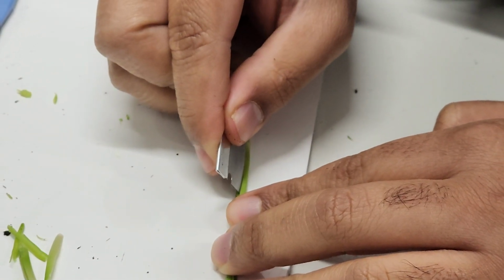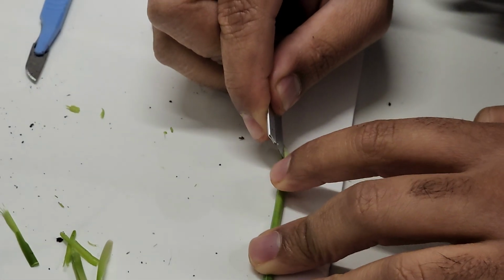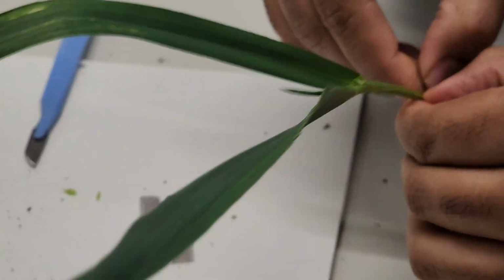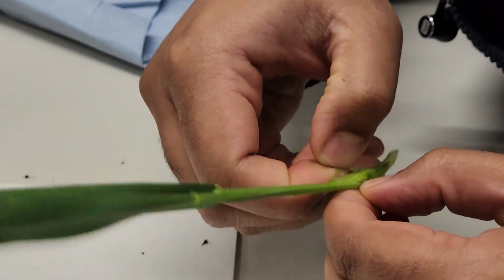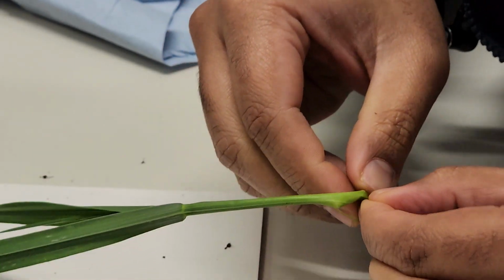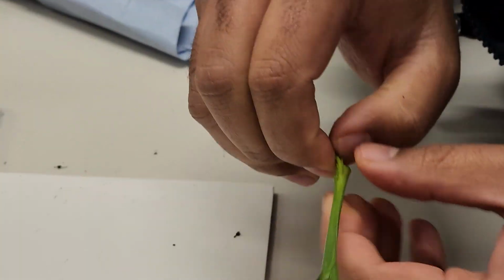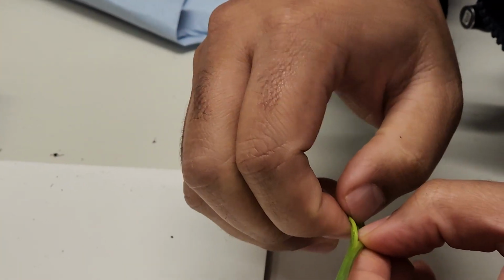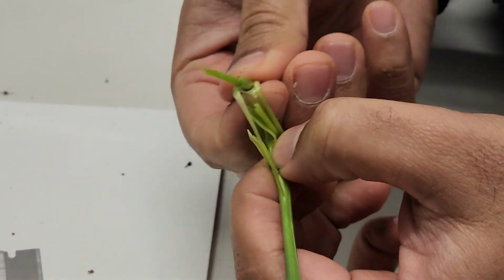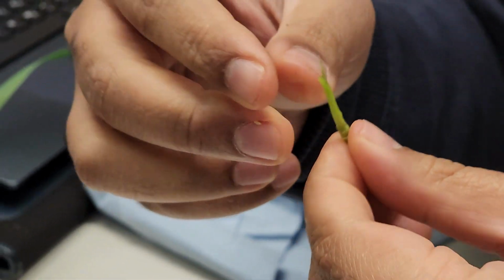Could you see with the phone earlier? Yeah. What did you see? The rattlesnake. No, the meristem, whose shape looks like the tip of a rattlesnake. Okay. Got it.